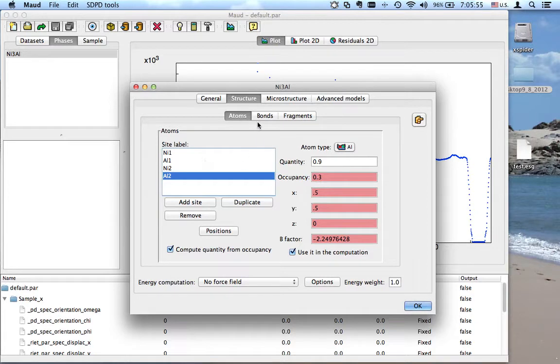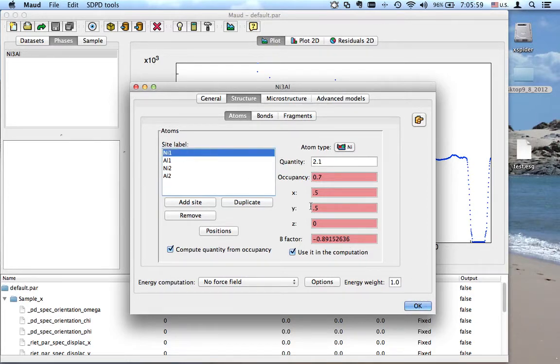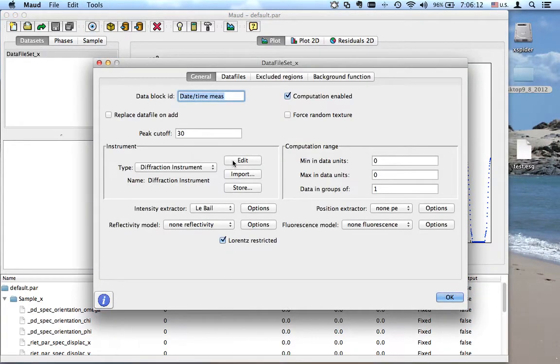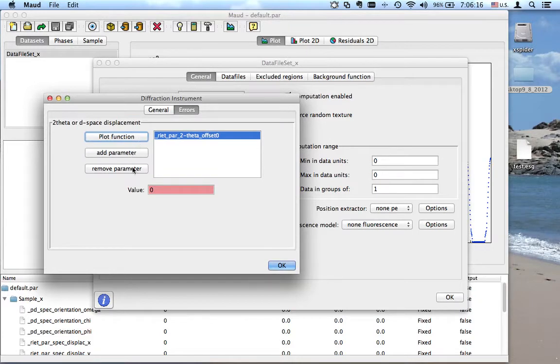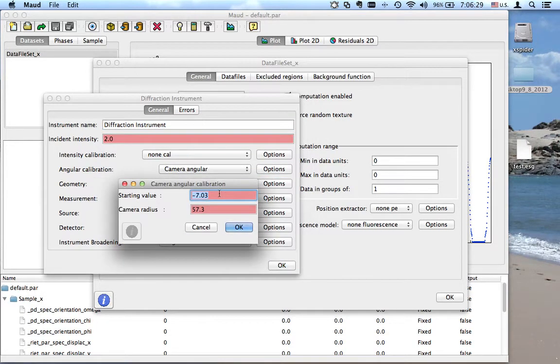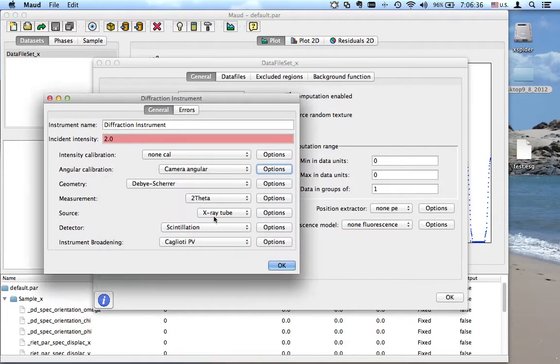The B factor is the starting B factor — we will take care of that later. Let's check the instrument again. I actually prefer not to use the two-theta offset error here, because the two-theta shift is controlled by the camera calibration starting value. It would only be a duplicate, so I remove that parameter.